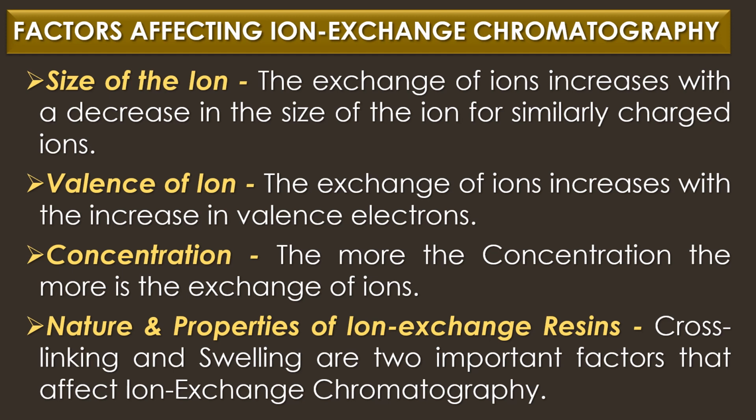The exchange of ion increases with a decrease in the size of the ion for similarly charged ions. The second factor is valence of ions. The exchange of ions increases with the increase in valence electrons. Third one is concentration. The more the concentration, the more is the exchange of ions. And finally, nature and properties of ion exchange resins.